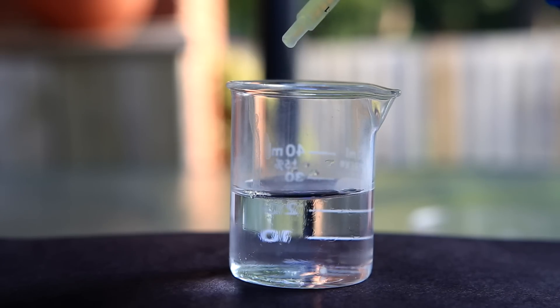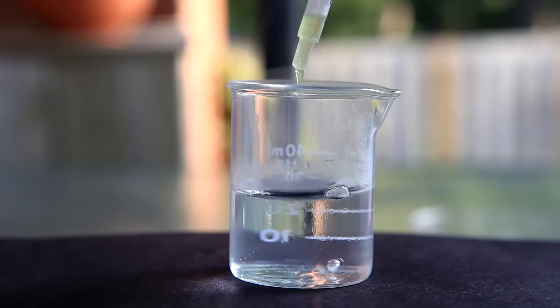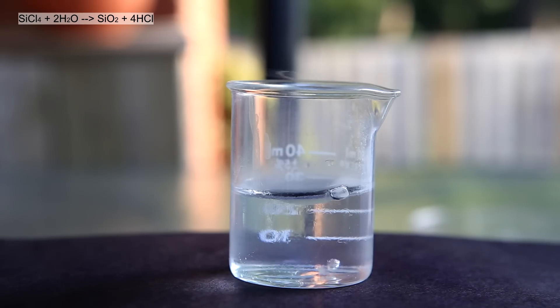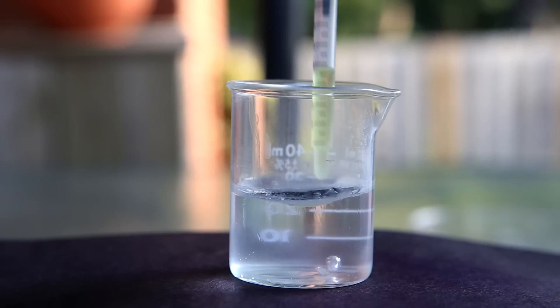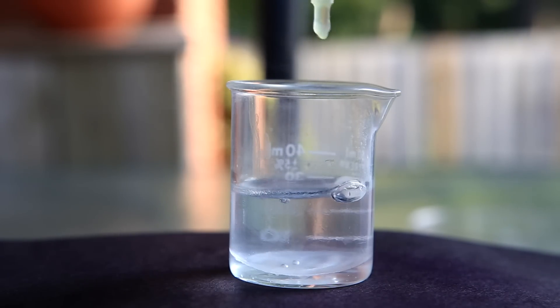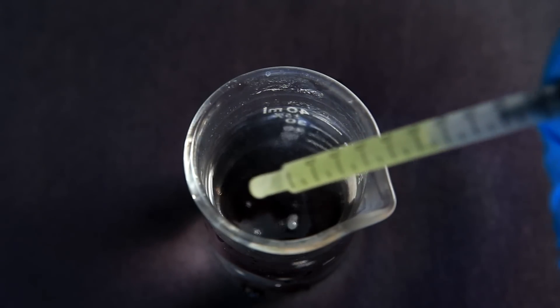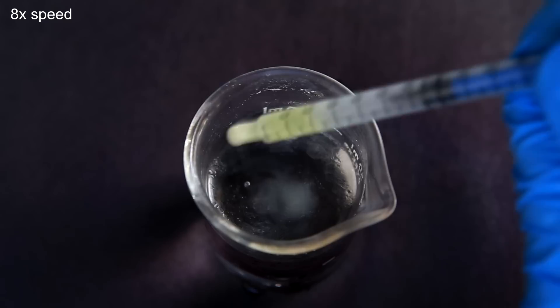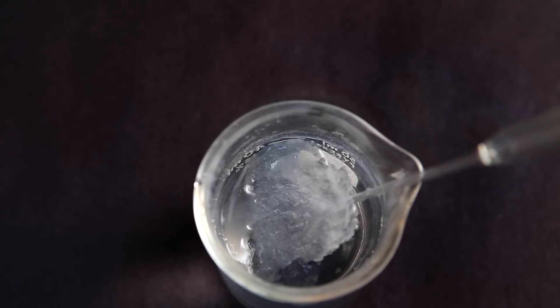Now for the fun part — putting the silicon tetrachloride into some water. The reaction was much more relaxed than I thought; I expected it to be quite exothermic and violent. Using a syringe I add it dropwise to the water. Most of it floats on top and reacts to form silicon dioxide. The reaction is: silicon tetrachloride reacts with water to produce silicon dioxide and hydrochloric acid. You can see a little layer of silicon dioxide fall down once it's done reacting. From above you can watch the silicon tetrachloride reacting with the water, and as more is added a layer slowly develops on top. I'm going to speed it up to about eight times speed.